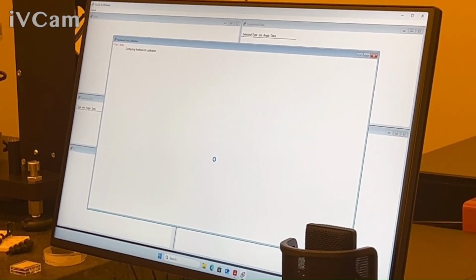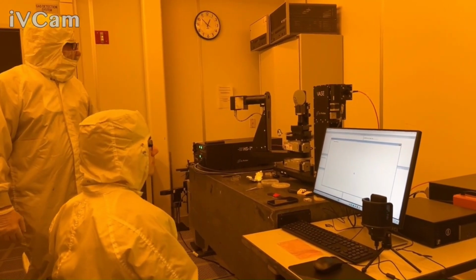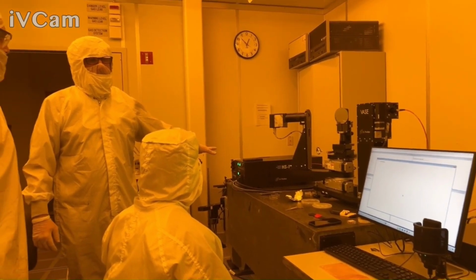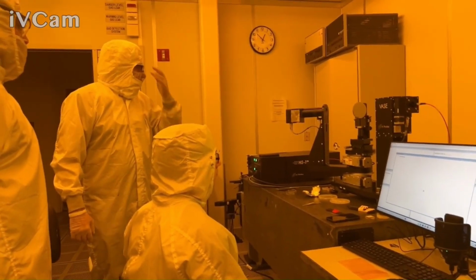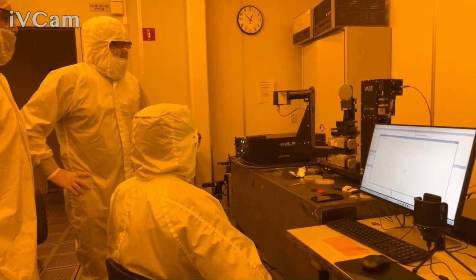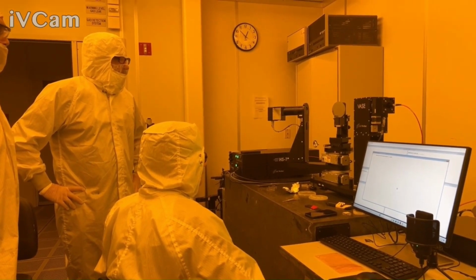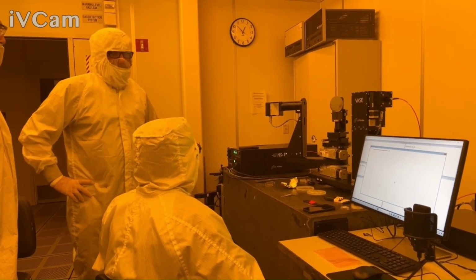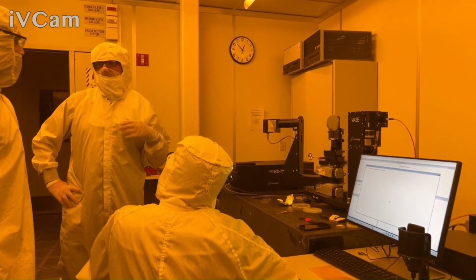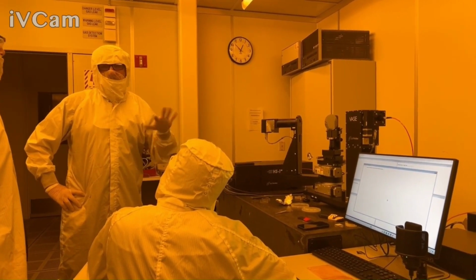So again, this is because we restarted the software, so it shows it's not calibrated. Just to show, we left the lamp on since it was already warmed up. But again, I wanted to show that, to be familiar with that, because that's a pretty regular occurrence. And then when that's done, I figured we might do some reflectives, and then we can look at that data as well. Just depends on what.